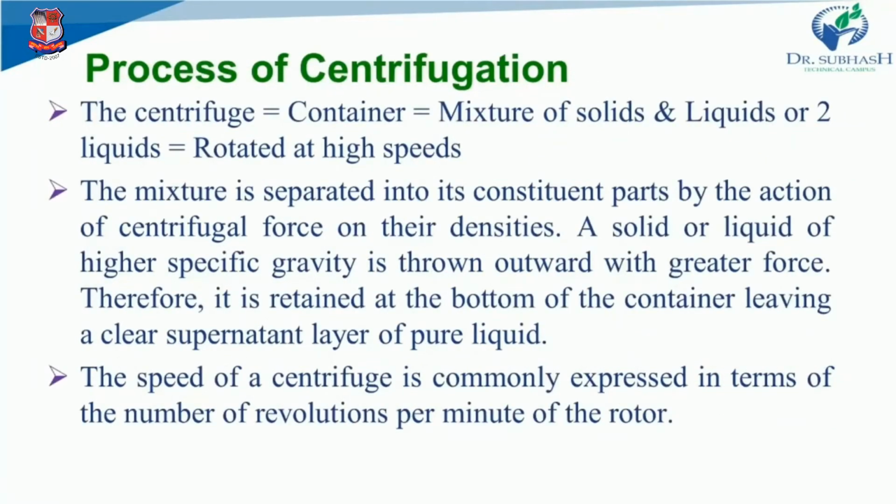Next is process of centrifugation. Process of centrifugation is very simple. As I mentioned in the last slide, the centrifuge, that is the equipment, consists of a container which contains a mixture of solid and liquid or two liquids that are immiscible, and they are rotated at very high speed, right?